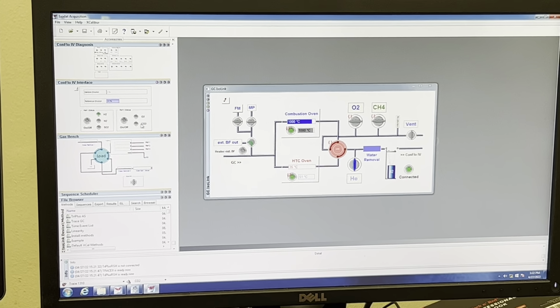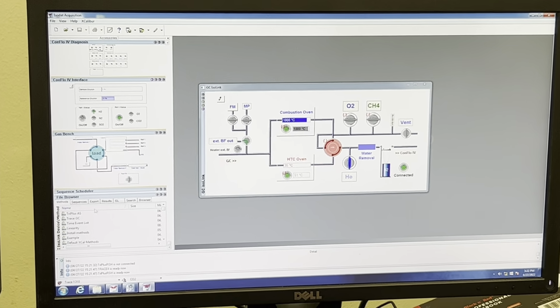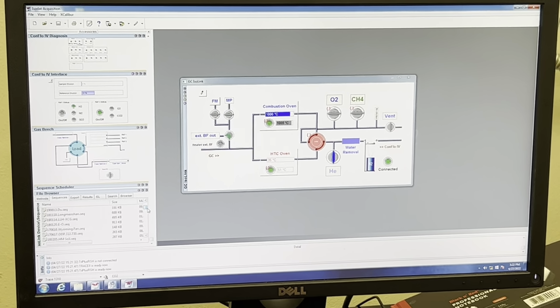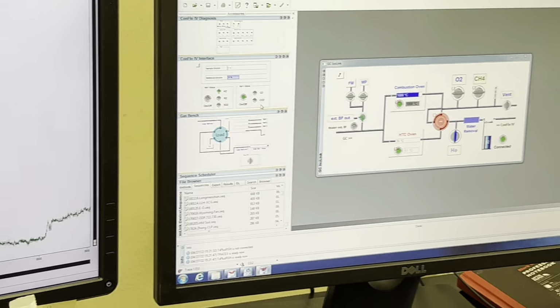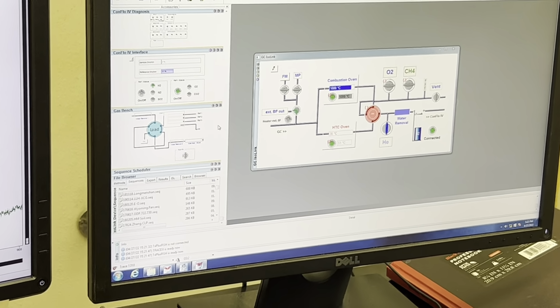We went to do, you're doing CO2? You said, yeah, CO2. I'll let you run it. Oh, okay. I don't know where your stuff is. Do you want to just do some on-offs? Just a few rounds, just to see.